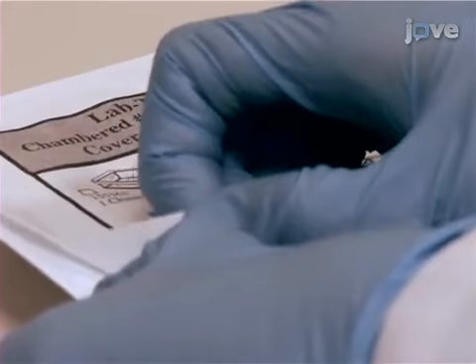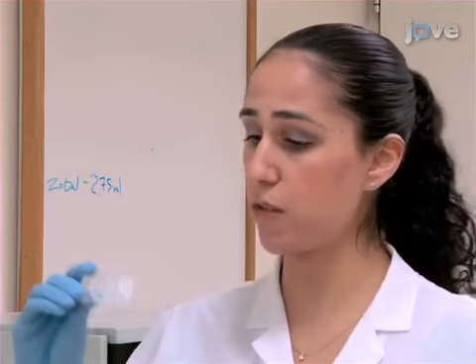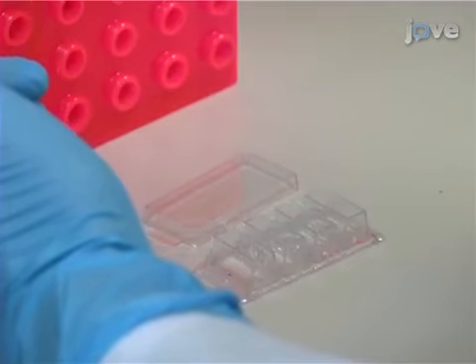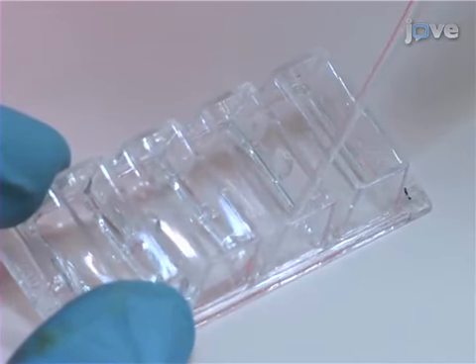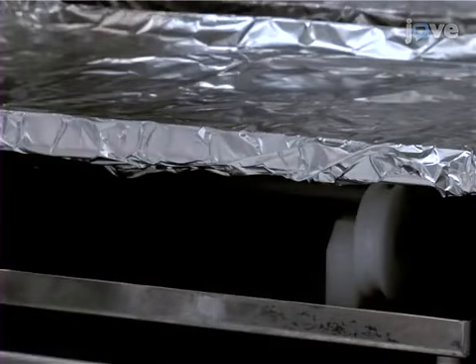Begin with preparation of the 4-chamber slides. Make sure not to accidentally scratch the inner surface of the chambers during preparation or use. Fill each chamber of the slide with 500 microliters of slide preparation solution and incubate at room temperature for 10 minutes. Aspirate off all the liquid. Then, incubate the uncovered slides for 1 hour at 45 degrees Celsius to dry.